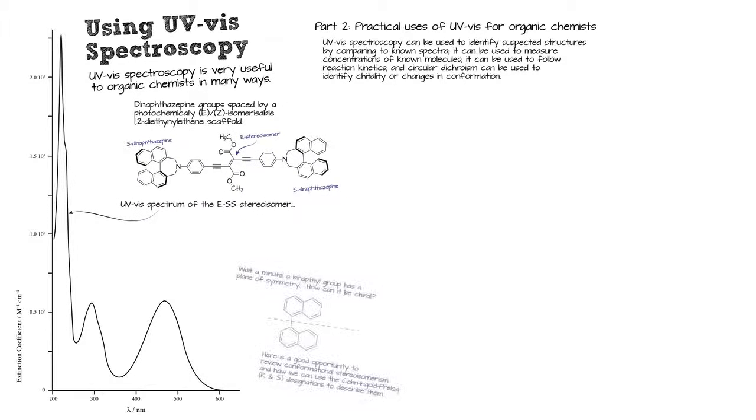Now, if we shine UV light on it, we're going to start to see the Z isomer start to come in. So the UV spectrum changes a little bit. We're going to start to see a little more. The UV spectrum's changing a little bit. You can see how the absorbance, this might have been due to the E isomer, and we're starting to see some absorbance due to the Z isomer start to form here around 400. So obviously the two molecules have different spectra. And now we see a spectrum that is the result of a mixture of E and Z.